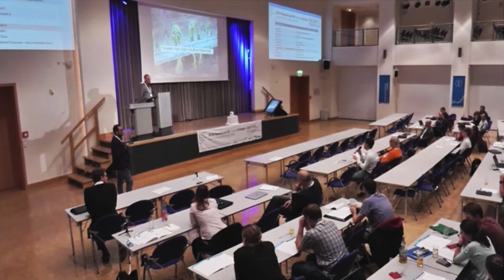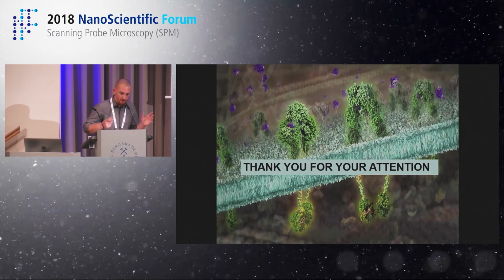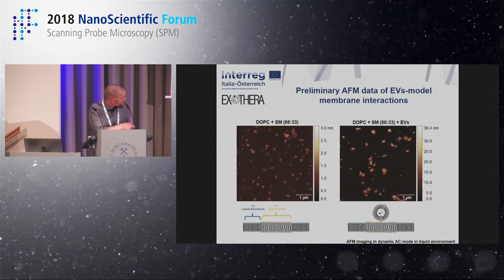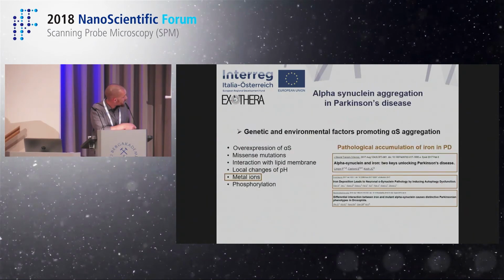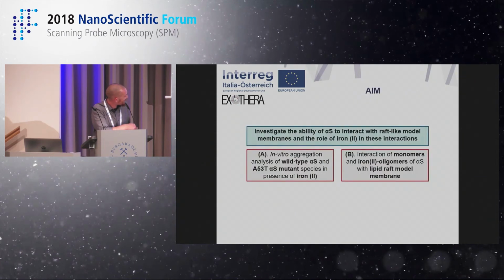Thank you for your really interesting talk. I was curious: in your experiment you are using a man-made membrane, so there are no proteins on it? No, it's an artificial lipid bilayer. You have just lipids, DOPC, sphingomyelin and cholesterol. You create vesicles without proteins, and then you spread your vesicles on mica. Usually we work with mica. In liquid, you obtain the planar lipid bilayer.